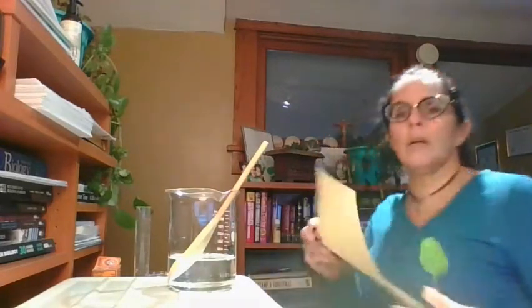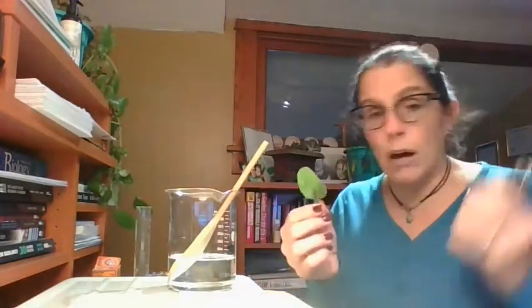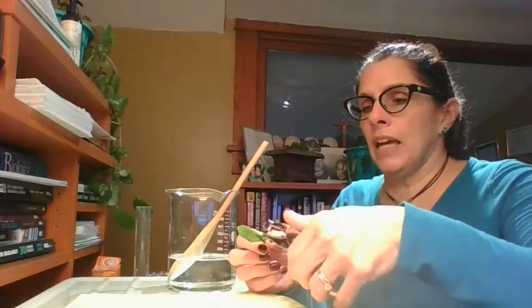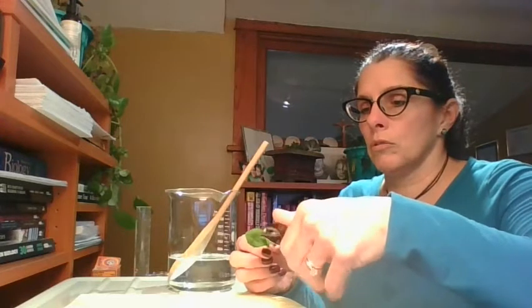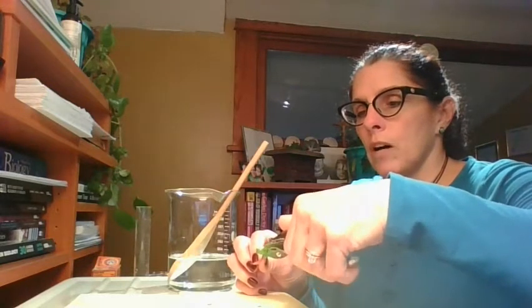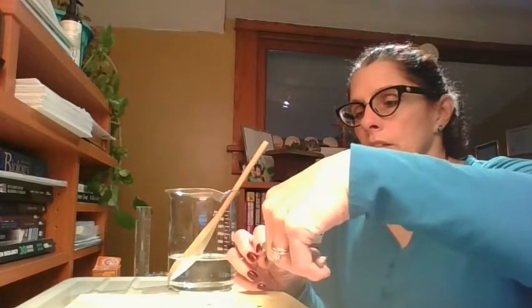I'm going to grab a piece of paper right here. I need to take this leaf and punch out 10 holes. I need 10 little leaf discs. The leaf discs are kind of a pain, but I'm going to get 2, 3, 4, 5, 6.